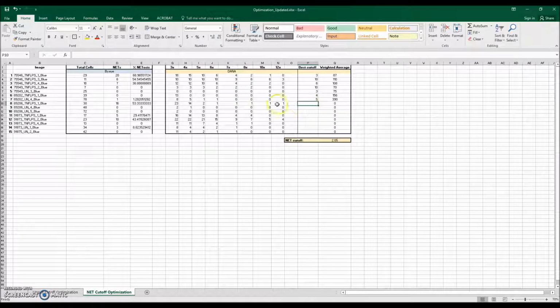We're basically just choosing the cutoff that most accurately represents our data. So this is 16, so it's closest to 4x. This one is 0. I would choose the 5 one because it's the first 0. This one's also 0. 4 again. This one's 5 nets, and that's the closest to the 7 cutoff. 10 nets.